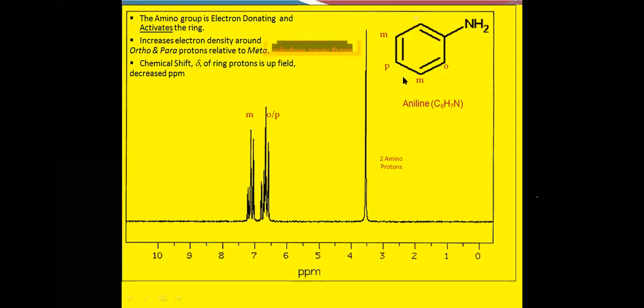Another, benzene having two types of proton, one is due to the ortho and para, another is the meta. So ortho and para, look at it, they are splitting. It looks scattered, and you can see finger-like projections. It is actually one peak, but it is split. That's why it is called spin-spin splitting.